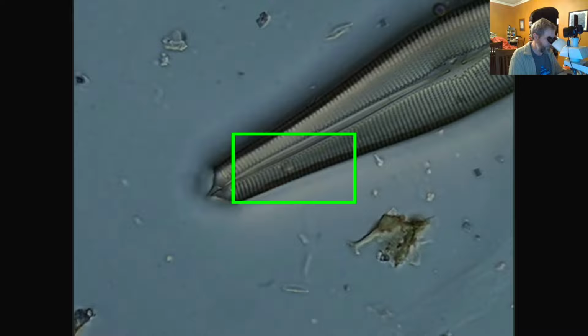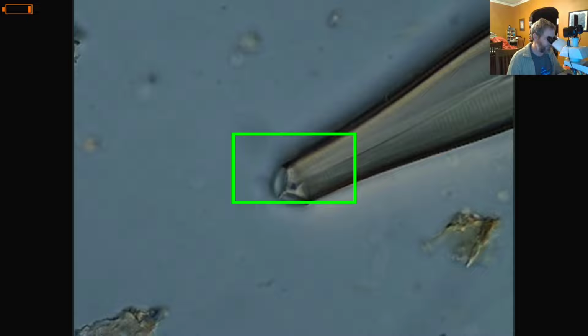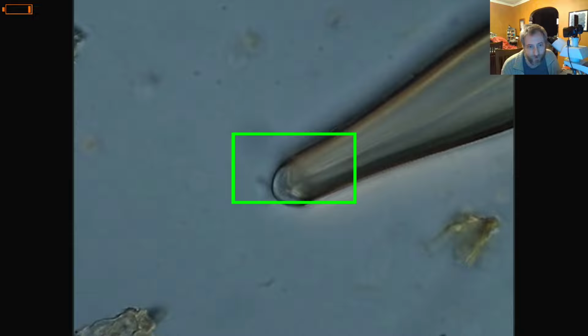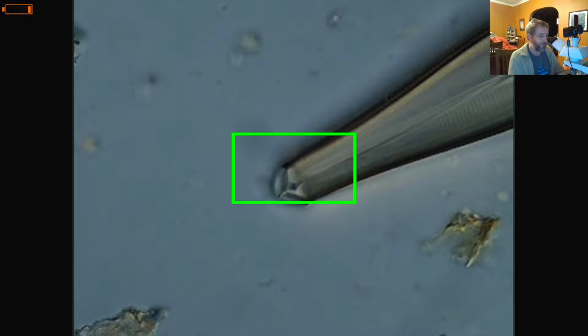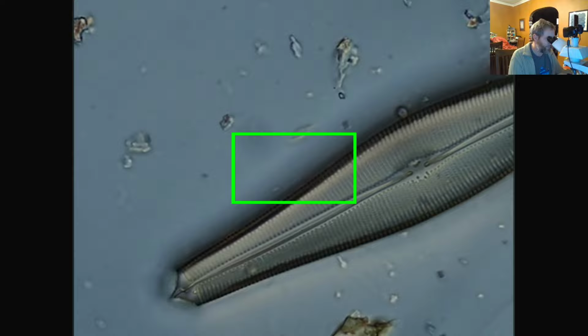this one just looks like a pore field that's really barely visible. It's almost clear, but when we look at this on the stream tomorrow, I'm sure I will see some of these. That little pore field is made up of a whole bunch of little tiny holes like a salt and pepper shaker that you can't see in the light microscope, even with the best microscopes. Or maybe you can see kind of a trace of it with mine, but zooming in is not going to help. We still aren't going to be able to see those holes very well.